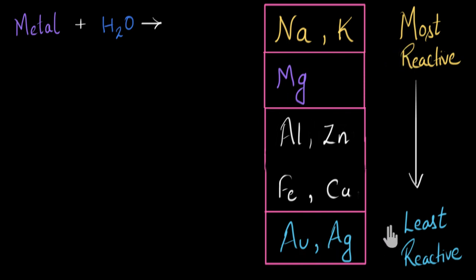But there was a problem with this list. See, over here at rank 3, you can find these 4 metals being grouped together. We weren't able to sub-rank them. So our hope with this new experiment is that we will arrive at a more detailed, more well-organized list.